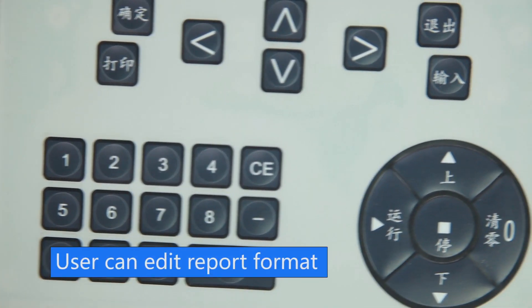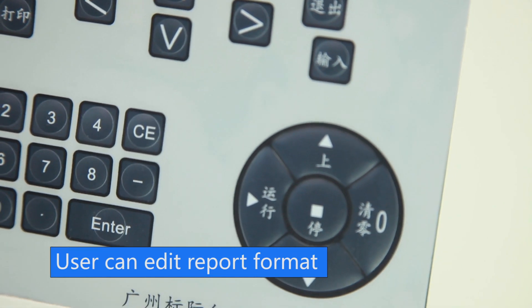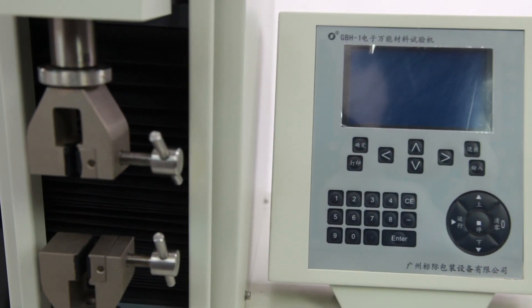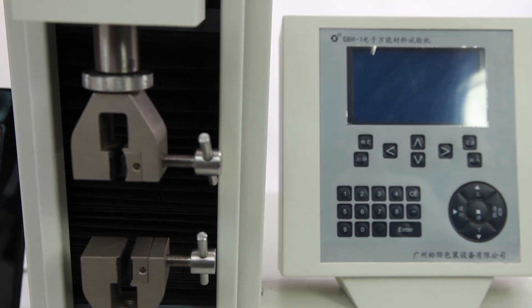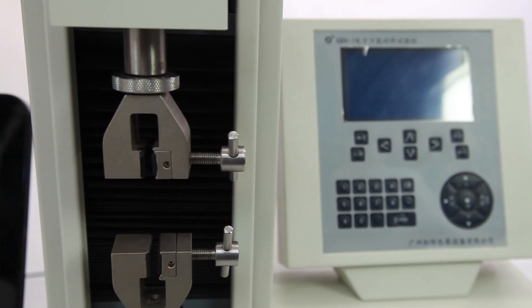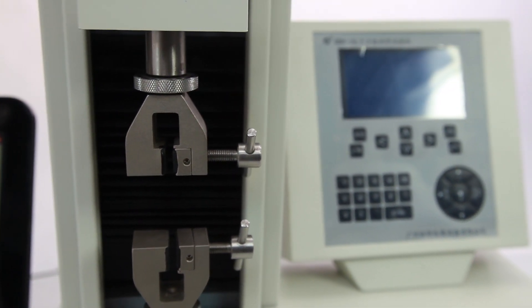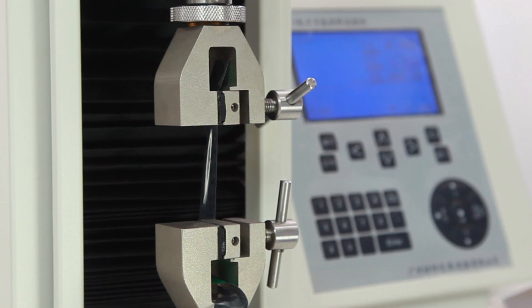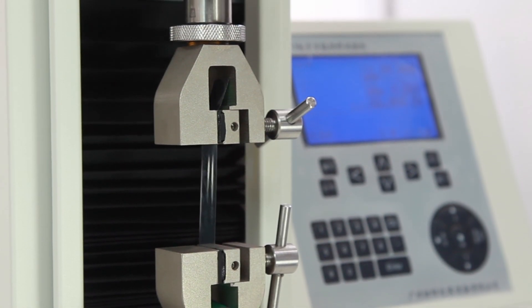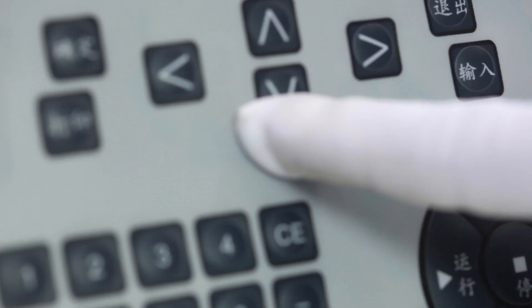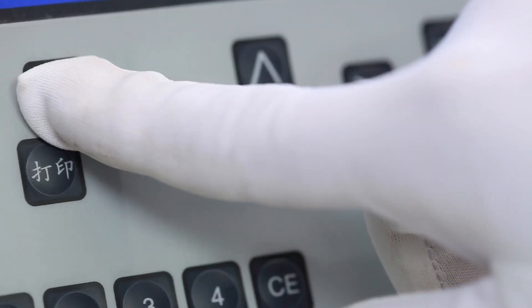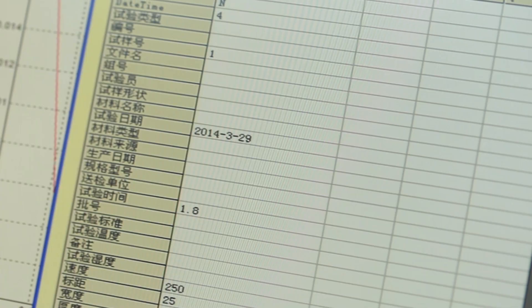Users can edit report format. It is modularized in design and can extend functions. The whole test process can be controlled by computer with online display of test results.